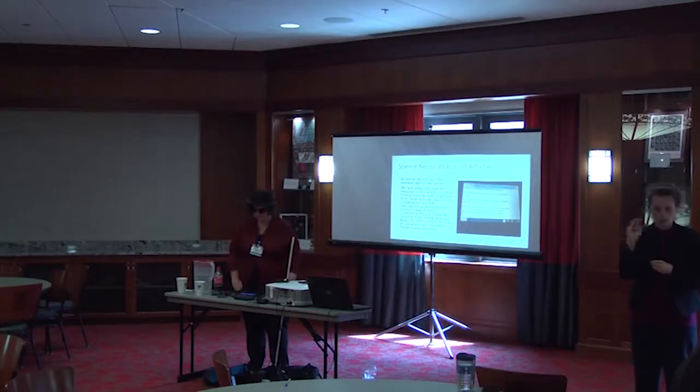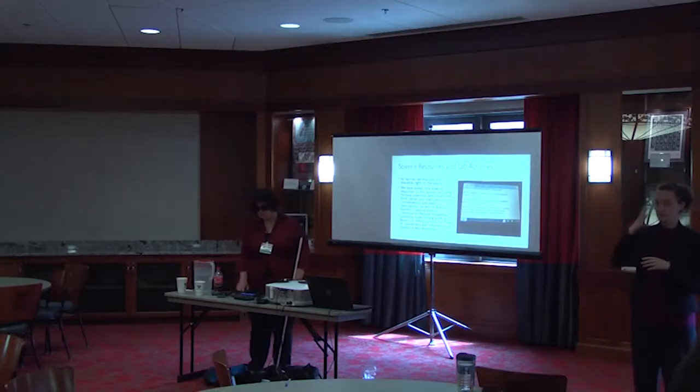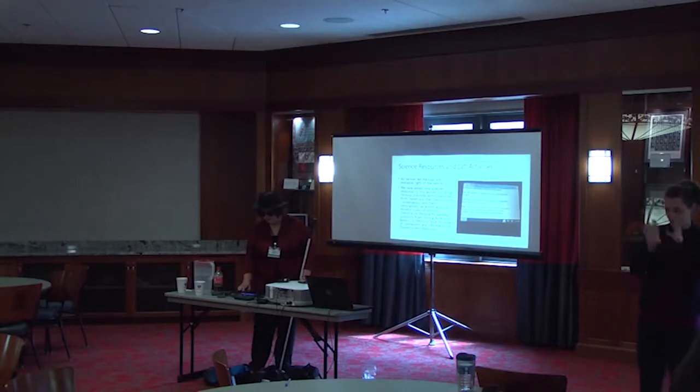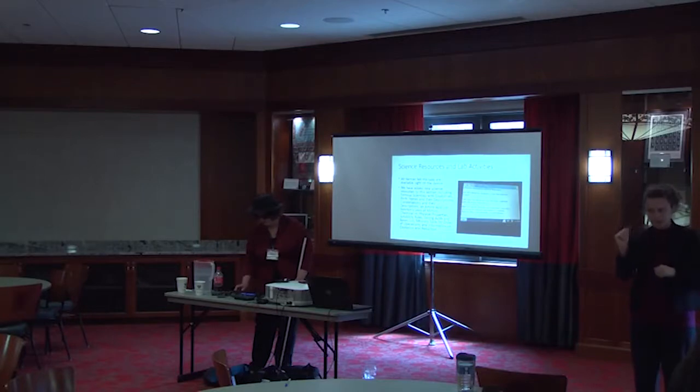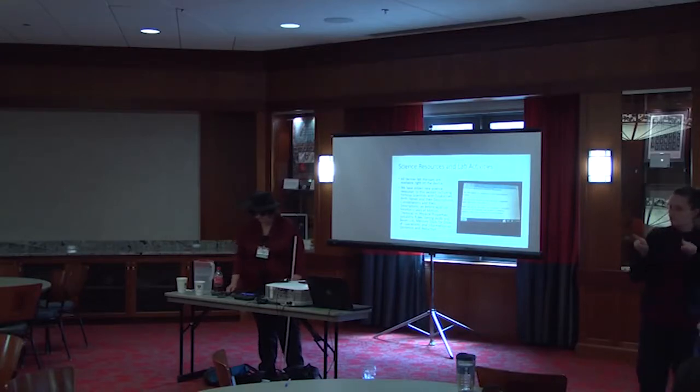We can make that softer or louder as people prefer. And CH1. Then we can record temperature data at the touch of a button. 21.9 degrees Celsius. Main desktop. F4 is kind of a back and forth key, so if I was on the periodic table last, it will flip me to the periodic table on the main desktop, or the LabQuest app in the main desktop, whatever the last two things you were in was.